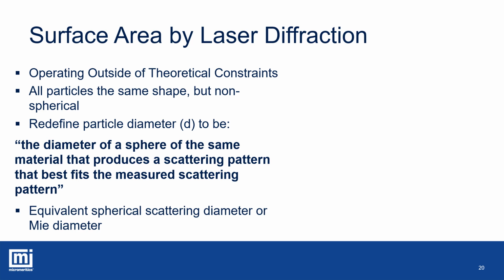The same is true when we calculate surface area from laser diffraction. It's an inversely proportional relationship on a log-log scale.